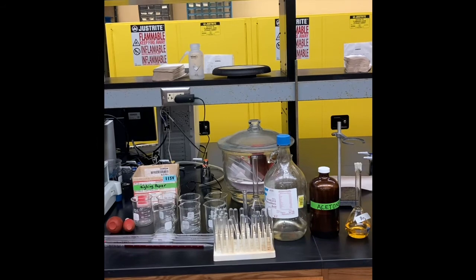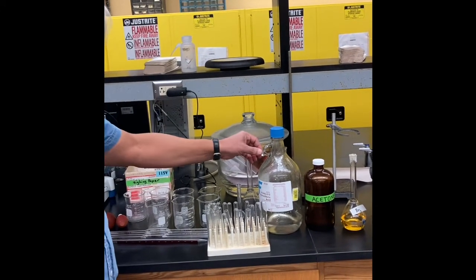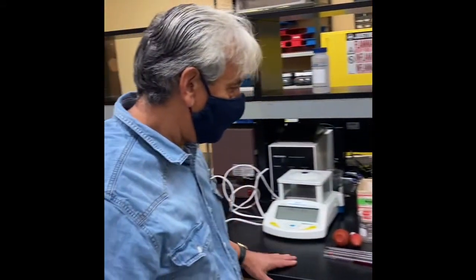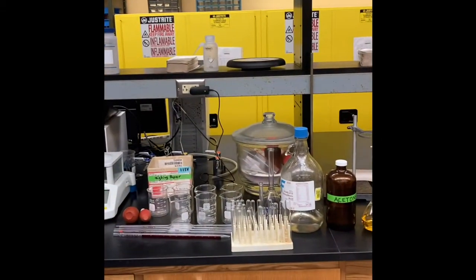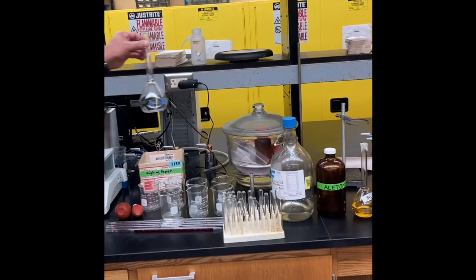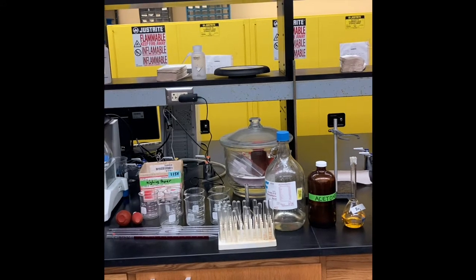The first step is to prepare stock solutions of hydrochloric acid and acetone, which are done by mixing a certain amount of hydrochloric acid or acetone in a volumetric flask and adding deionized water to the mark.